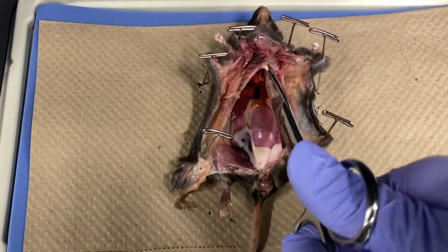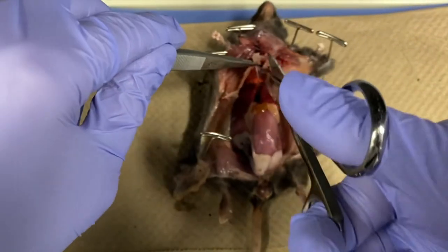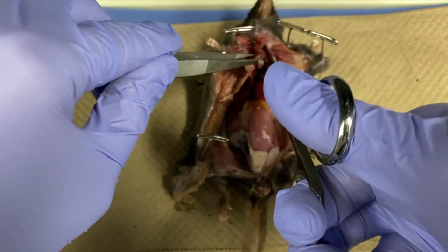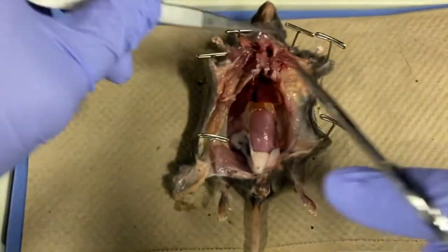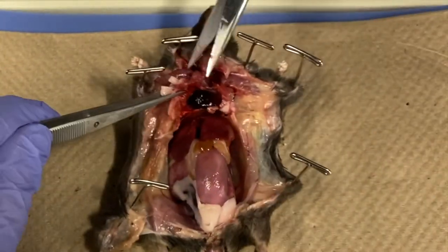To dissect the thoracic cavity, cut up the middle along the sternum and then through the bones of the rib cage. Remove the sternum, ribs, and pectoral muscles.